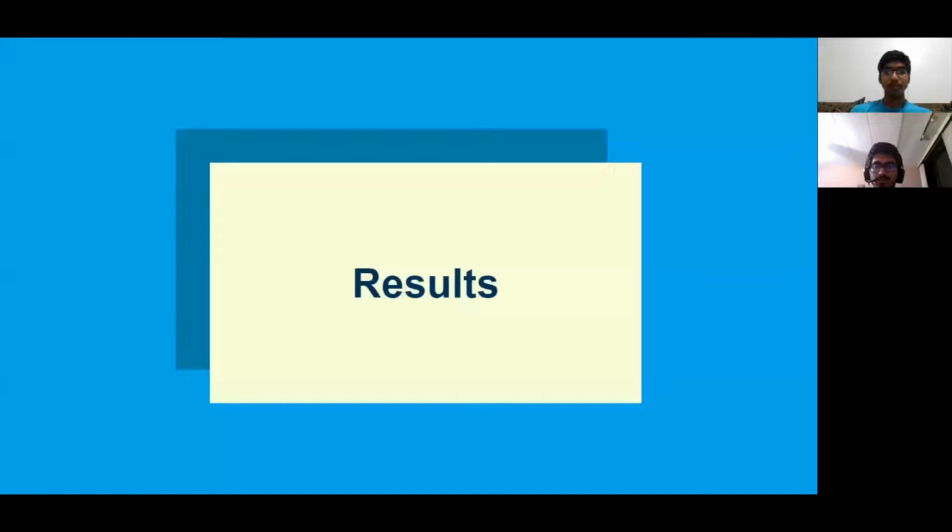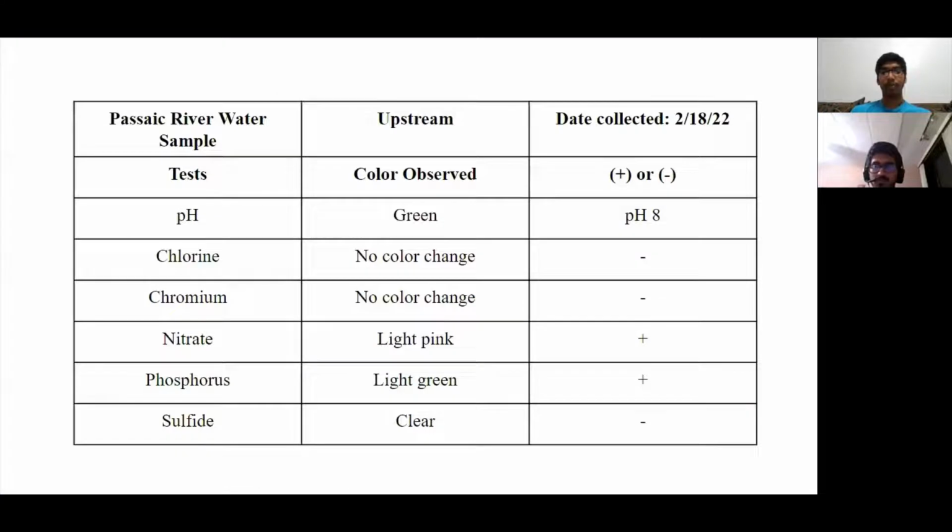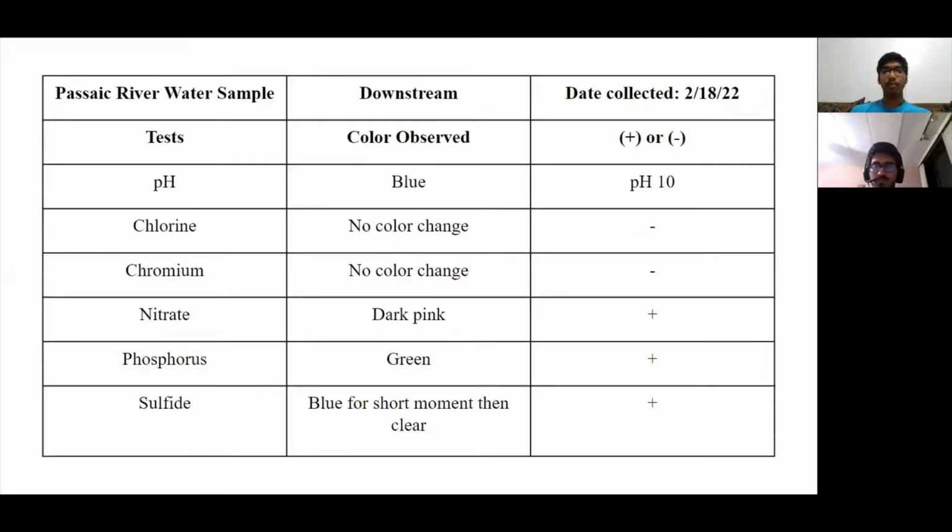So our results. So here is a representation of our data in table format. This is the water sample from upstream, and this is the water sample from downstream. Both samples were collected on 2/18/2022.